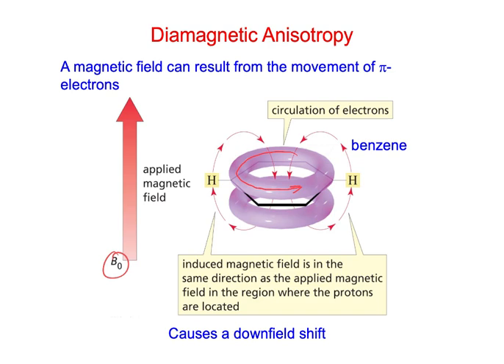And that in turn creates a magnetic field. It has these magnetic field lines. You've probably seen magnetic field lines drawn on the Earth or something like that. Notice here, this is the induced magnetic field from the movement of the electrons moving around like this, all the way around.